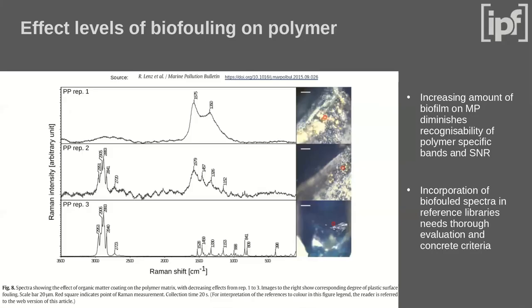We also saw what has already been found in previous studies, that if there was a lot of degradation going on, the spectrum diminishes either partly or completely. So this is an older paper, but I posted it here because this effect we could see also for some polymers, that you can come to a point when there is a lot of biofilm growing on there, you cannot recognize the spectrum anymore as what was in this case PP originally. Yeah.